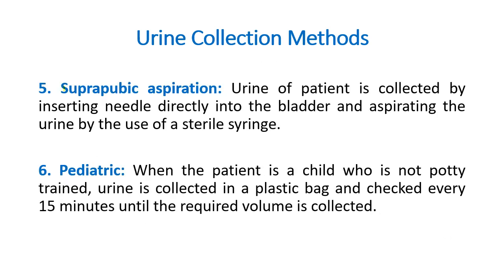We also have suprapubic. Ano tong suprapubic? Ito yung tinutusok yung mismong urinary bladder. So, inserting needle directly into the bladder and aspirating the urine by use of sterile syringe. Pag pediatric, ito naman yung mga merong wee bag na tinatawag. Tapos it is checked every 15 minutes until required volume is collected.